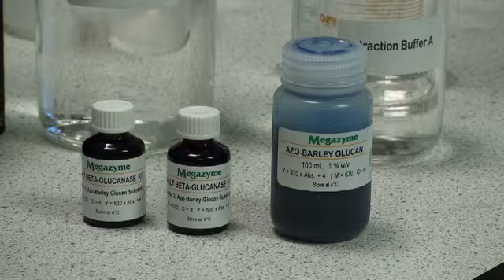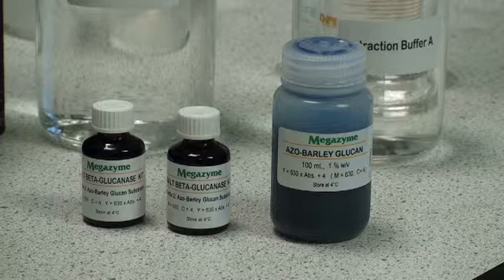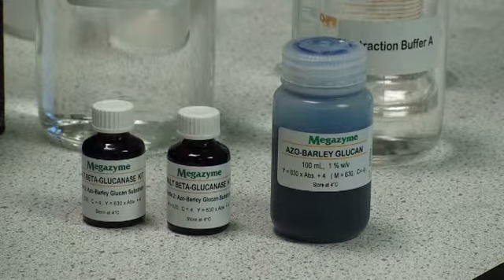Azo barley glucan solution is provided in a form ready to use immediately. This should be warmed to room temperature before dispensing and should be dispensed with a positive displacement dispenser because the solution is quite viscous.